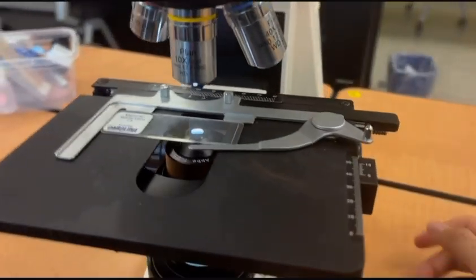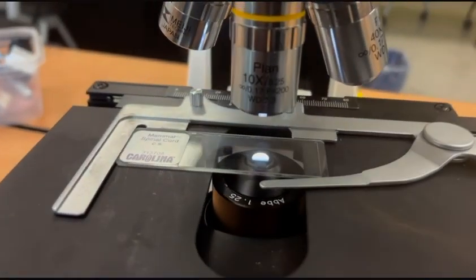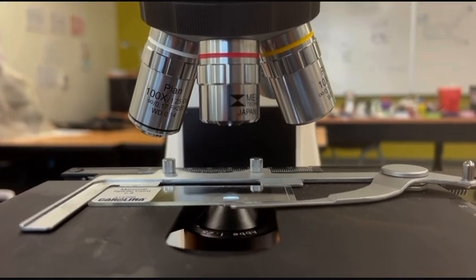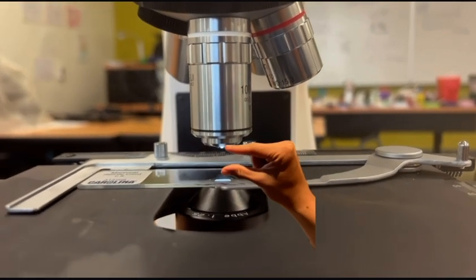As for a microscope, it's very similar in that your Z-plane control, which is the coarse and fine focus, will control the working distance, which is like the f-stop. Another thing to be aware of is that the working distance when you're working with 100x is going to be a lot smaller than with a 4x.